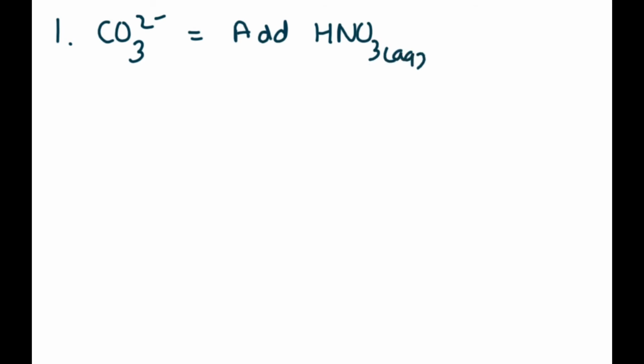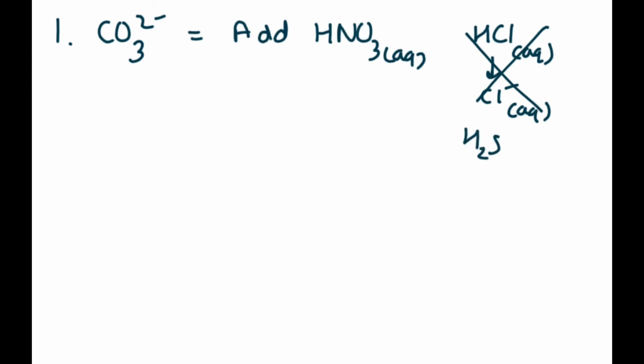Okay, there's no point adding hydrochloric acid. What will happen if you add hydrochloric acid? That will release chloride ions and confuse results. So you don't want to do that. If you add sulfuric acid, then sulfuric acid will release sulfate ions and again confuse the results. So you don't want to do that.